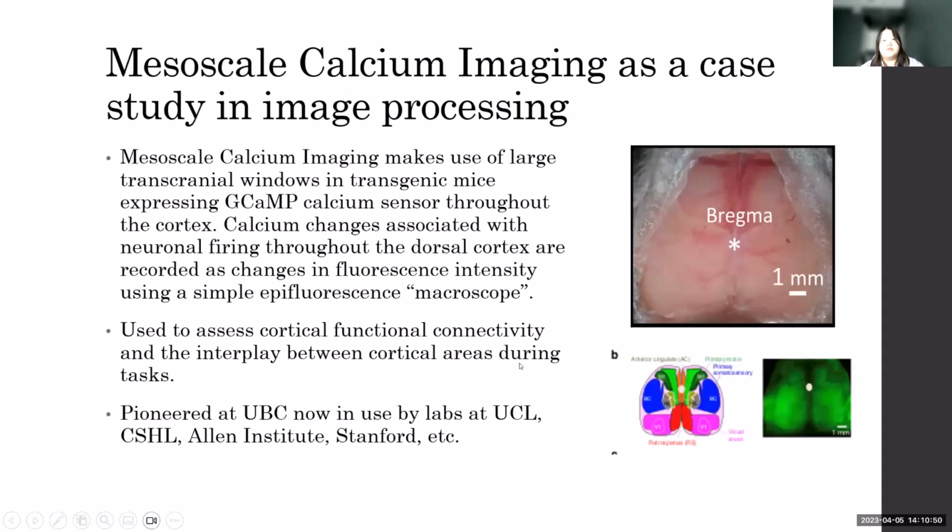So now Jeff is going to talk about some mesoscale calcium imaging. Yeah, so this is just to motivate the macro example that we'll work on after the simple rotator example.